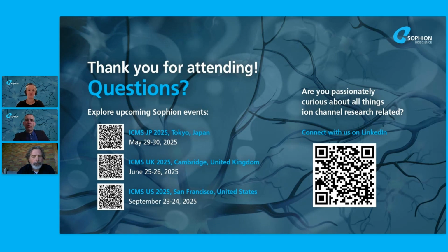And I'll quickly jump in while you're still around on the line, Scott, and ask you something around the genotype. So you showed some nice genetic screening data almost for some of your iPSC-derived FTD neurons. How do you find that RNA sequencing, that genotyping almost of your FTD neurons, or maybe even some of your other disease neurons? How does that compare to what the literature suggests, and in terms of how that genotyping might then relate to the disease state phenotype that you might be looking for?